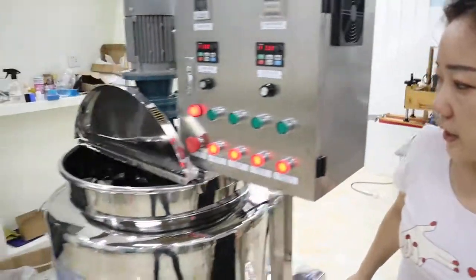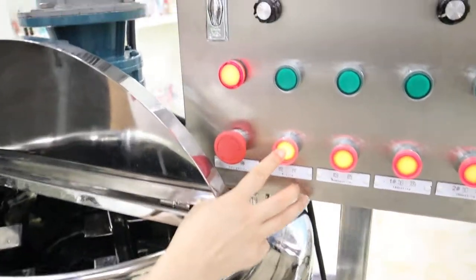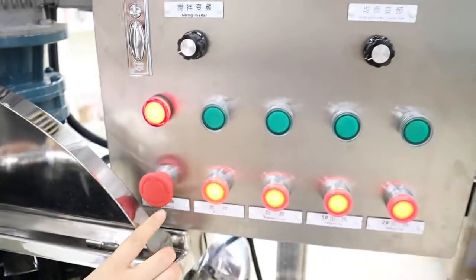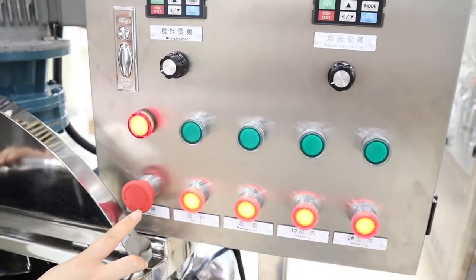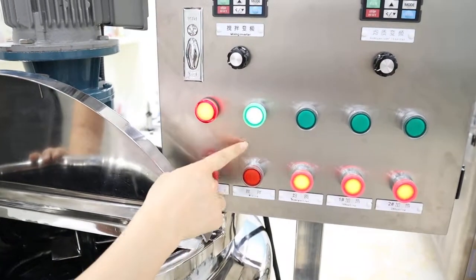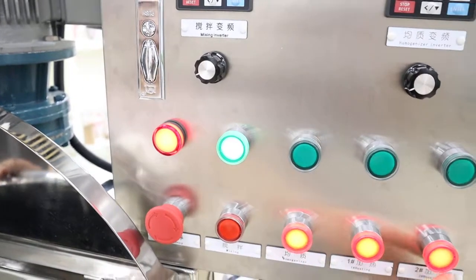Now we adjust it. Open the mixing. Open this switch first. This is the switch — this is all the switch. And this is the power indicator.